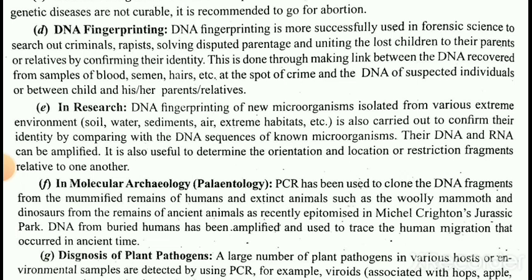E. In research, DNA fingerprinting of new microorganisms isolated from various extreme environments, soil, water, sediments, air, extreme habitats, etc. is also carried out to confirm their identity by comparing with the DNA sequences of known microorganisms. Their DNA and RNA can be amplified. It is also useful to determine the orientation and location of restriction fragments relative to one another.